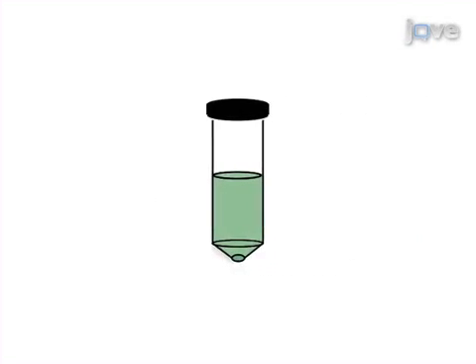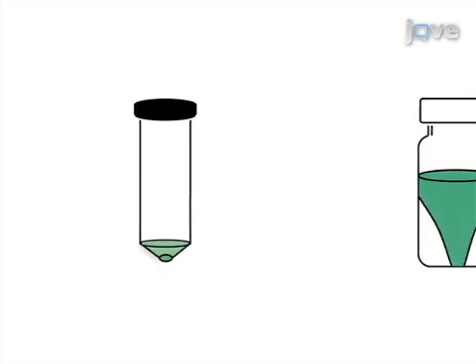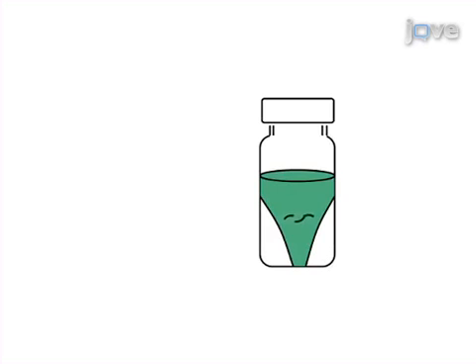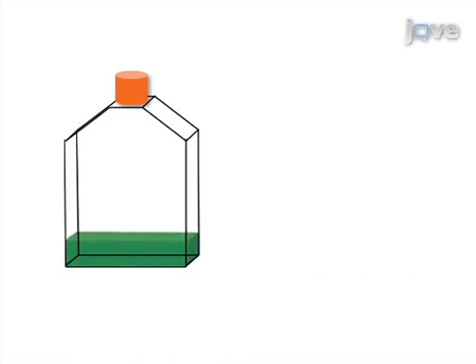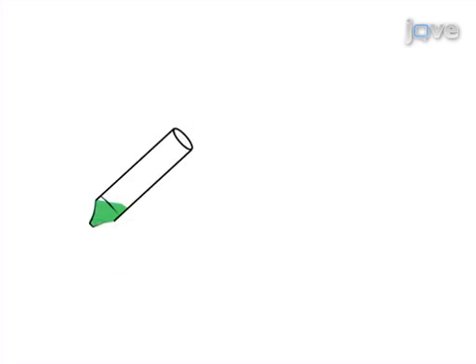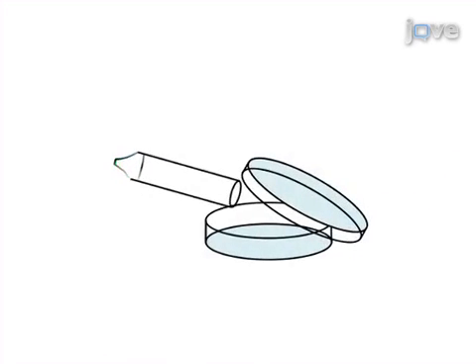This is accomplished by first generating cell pellets from 50 ml of dense algal culture per transformation. The second step is to mix the cells with linearized DNA and then to perform the electroporation. After diluting the transformed cells in fresh medium and incubating overnight, add 0.2% low melting point agarose and a selective agent and pour the mixture into small petri dishes.